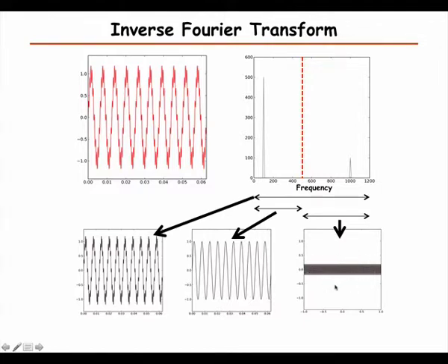So this is a very useful tool, as you can now probably see, to remove noise. When we just select high frequencies, that's called the high pass filter. So we remove the slowly moving components, and we let the high frequencies through. And in the same way, when we just let the low frequencies through, that's a low pass filter. And then we remove the higher frequencies.